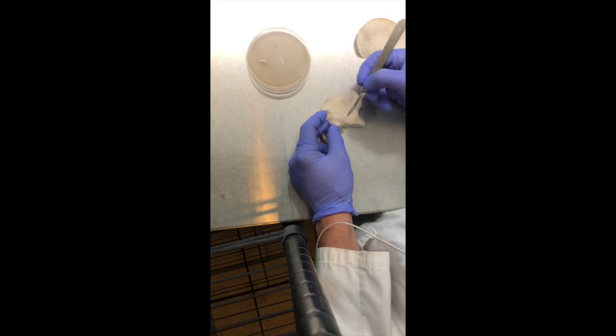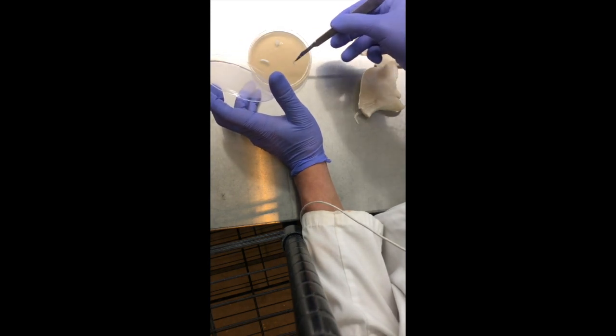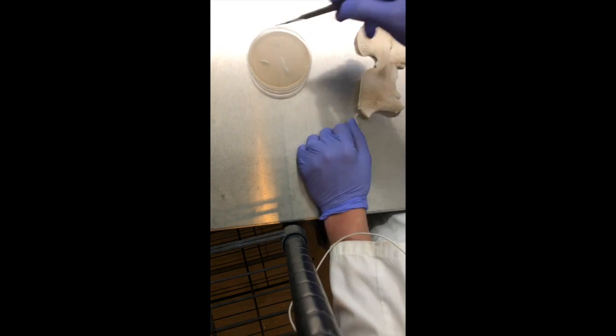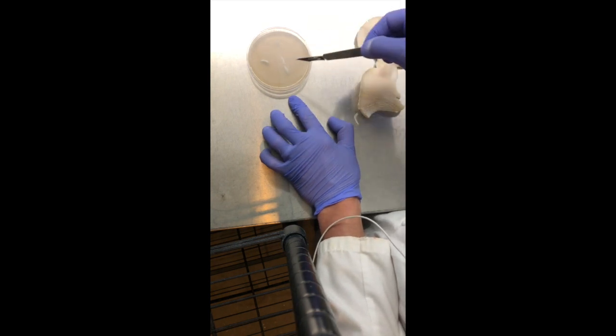One of the benefits of cloning like this is that I will most likely get the same phenotype. I started with a poly spore culture which resulted in quite a few different phenotypes, and one or two of those had really nicely shaped fruiting bodies that I'm going to be selecting for.